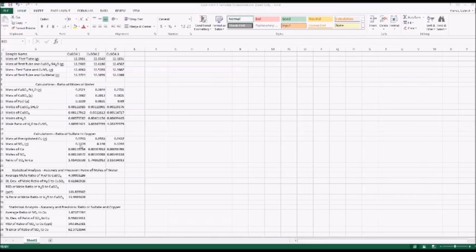However, in this particular experiment, due to time constraints and not wanting to use large amounts of the compound, we did go ahead and only use around 0.3 grams. Make sure that in your lab experiment, you comment on the accuracy and precision of your data. Remember again that accuracy is based on the percent error and precision is based on the RSD.